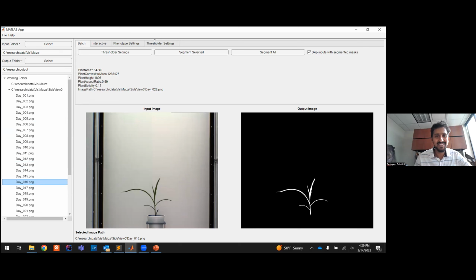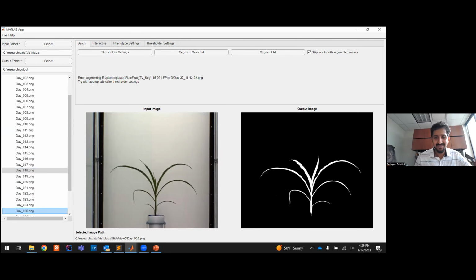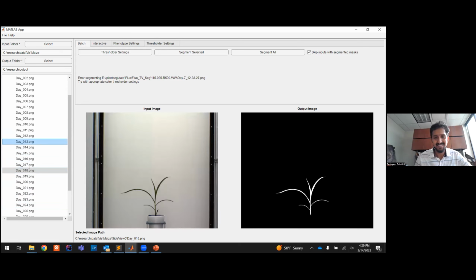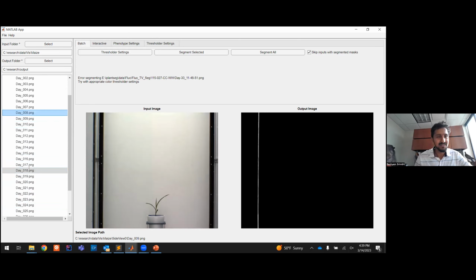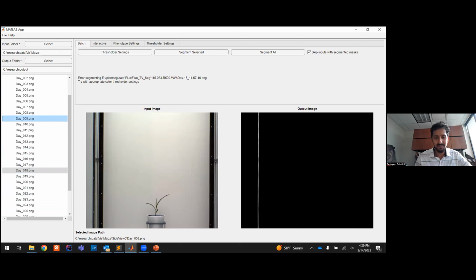Yeah, maybe I punched in wrong threshold settings. Okay, so it worked for these. Probably for this we need a different one. So let's try to fix this. It's a good problem to solve. So I'm going to fix that. Still working. It's okay.